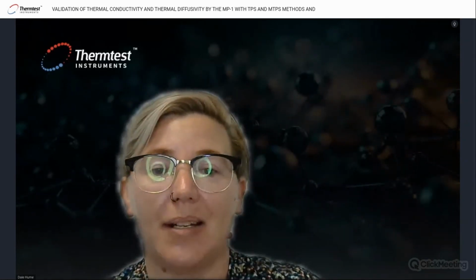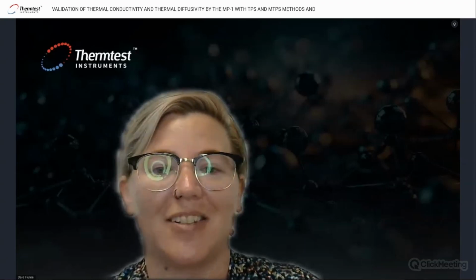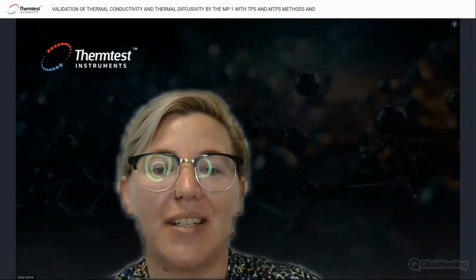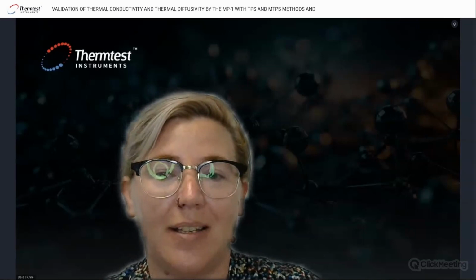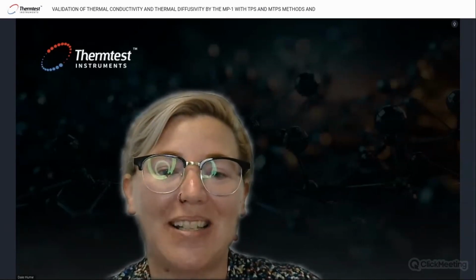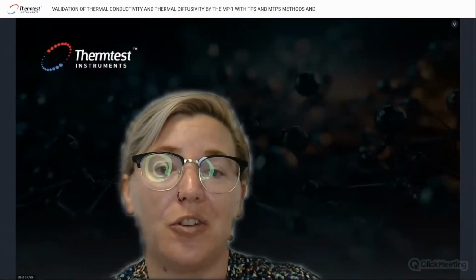In this webinar, we're set to explore the intricate process of validating thermal measurements using the Thermtest Modified Transient Plane Source, MTPS, sensor. We'll delve deep into the testing of Pyroceram ceramic, a certified material, to understand its thermal conductivity, diffusivity, and specific heat. This session promises to shed light on the potential of the MTPS sensor for future directional thermophysical analysis of polymers and nanocomposites.